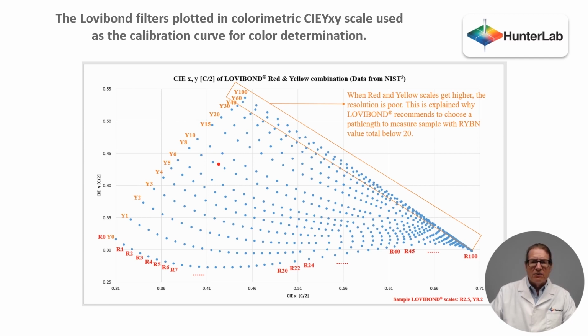Spectrophotometers are calibrated independent of color filters. Spectrophotometers use the laser lines of mercury, krypton, and argon to set their wavelength scale.